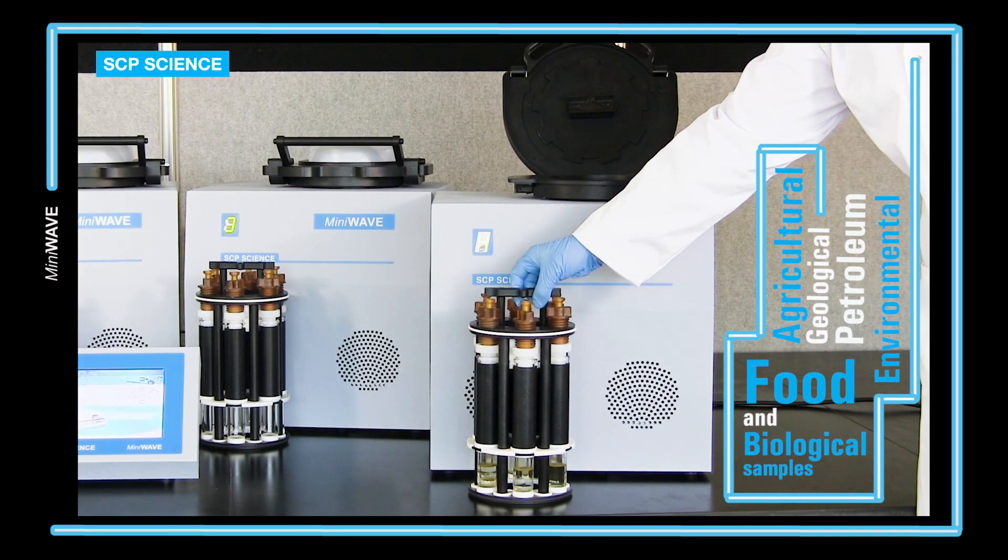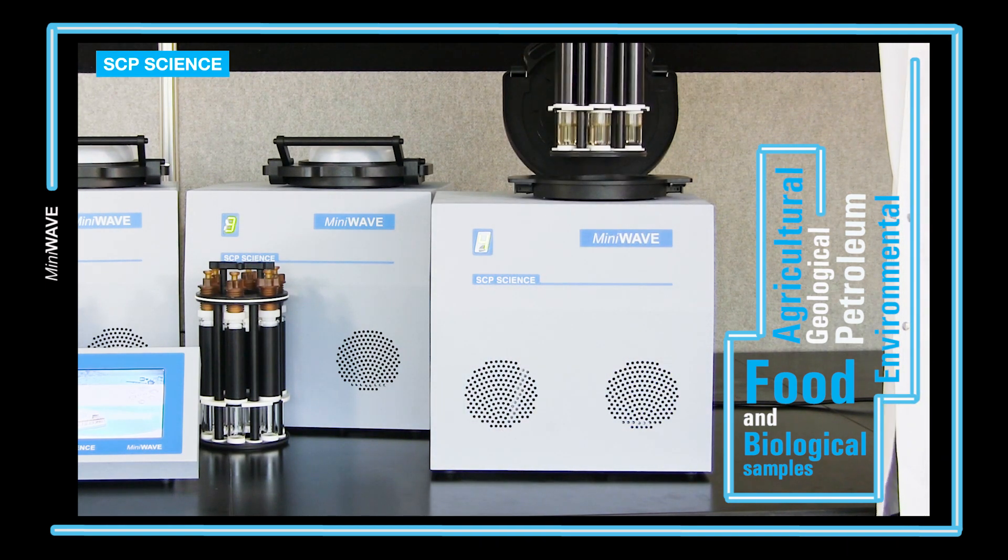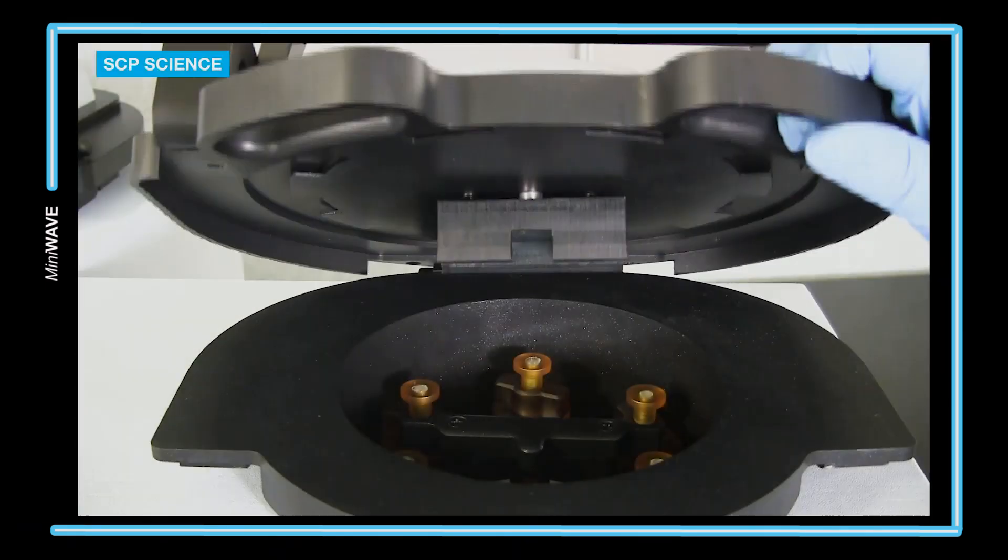The MiniWave is ideal for environmental, agricultural, petroleum, geological, food, and biological samples.